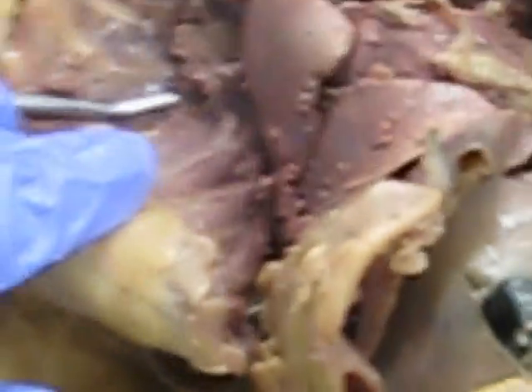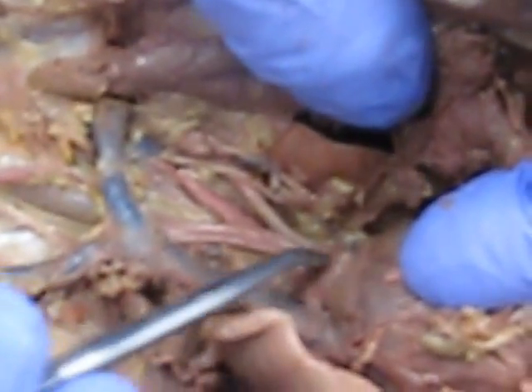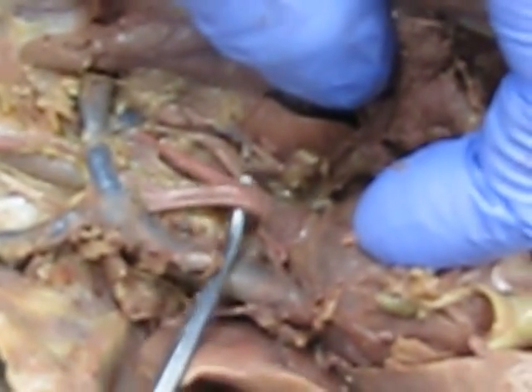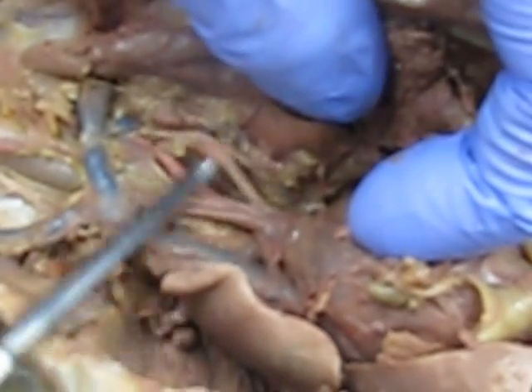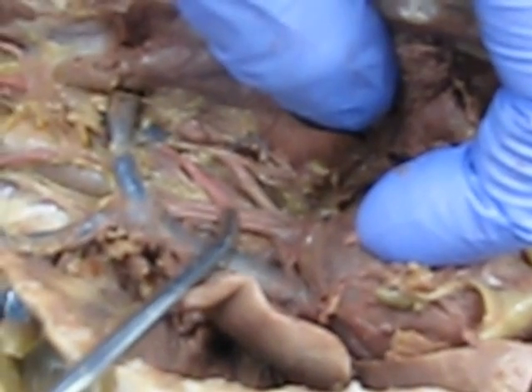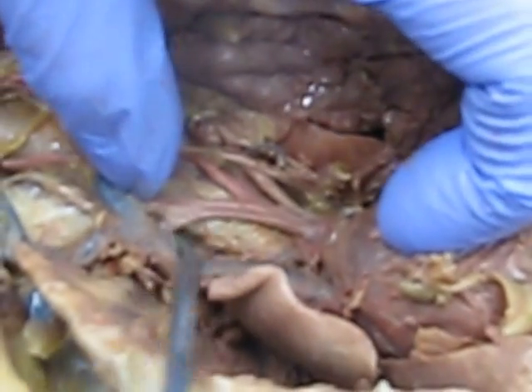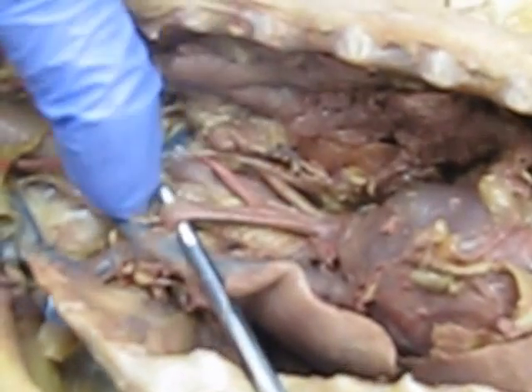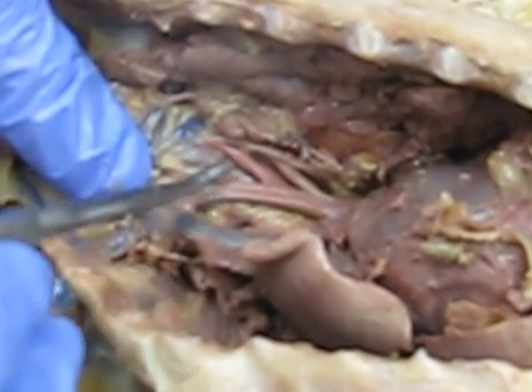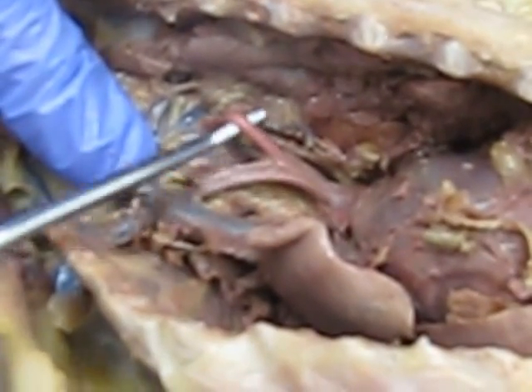So if we take a look at the vessels, we'll start in the thoracic cavity. If we find the aorta, and we look at the aortic arch, the first two branches are going to be the brachiocephalic artery and then the left subclavian artery. If we follow the brachiocephalic artery, it branches off into the right subclavian, which is here, the right common carotid, and then also the left common carotid.